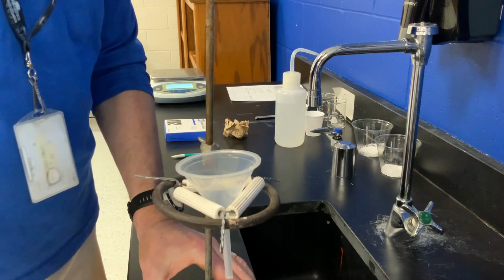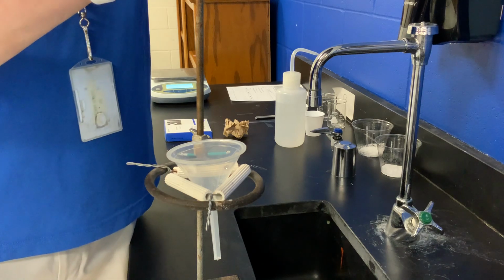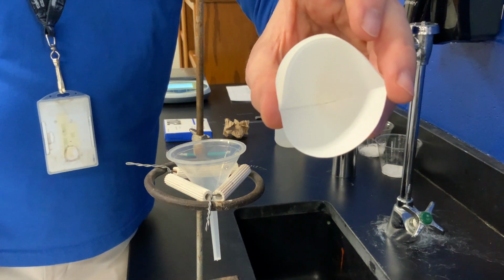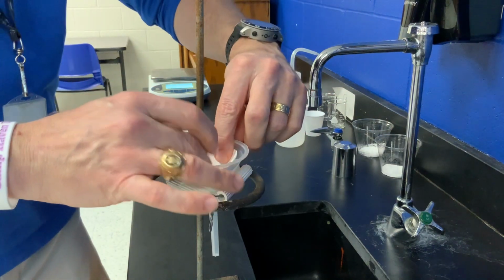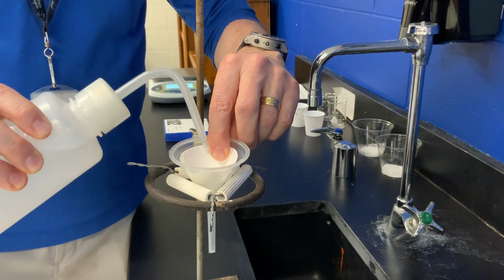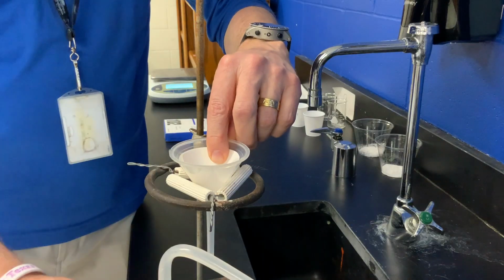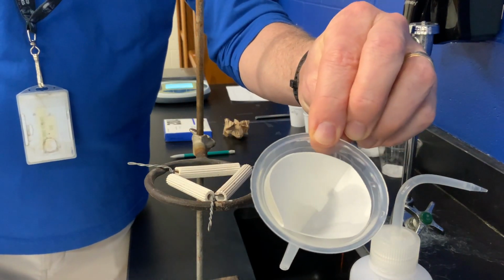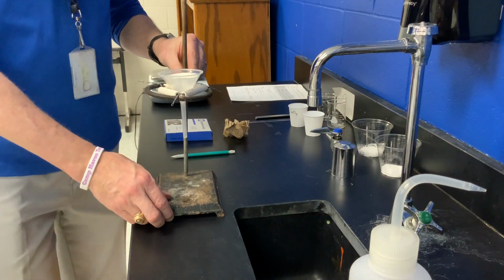You take your filtration apparatus, you open your filter so that you cannot see through it, okay? So it looks like a little cone. You put it into the funnel. You take your wash bottle, you hit it with 2 or 3 small squirts of water, and what that does is it sticks it to the funnel. After that, you follow instructions.